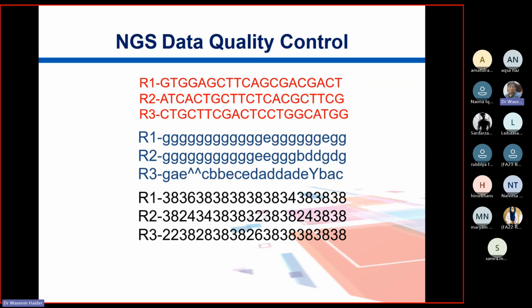And at position number two, all T, so 100% T, A 0%, G 0%, or you can also go with the probability scale, right? So 0.25 in case you have four reads and all four, so ideally they should be like 25% each, but obviously we know that GC content varies. So obviously when GC is higher, AT is a little bit lower than that. So we also check for that.